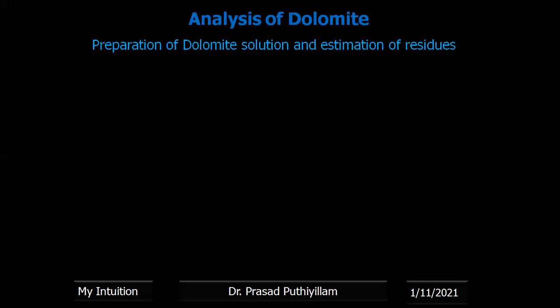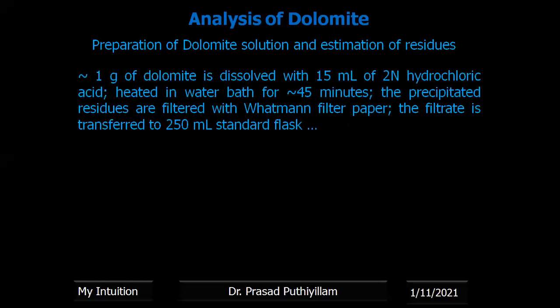Preparation of dolomite solution and estimation of its residues: approximately 1 gram of dolomite is dissolved with 15 ml of 2N hydrochloric acid. It is heated in a water bath for approximately 45 minutes to complete precipitation. If any residues are present, they will precipitate. The hot solution is transferred to Whatman filter paper; the residues and filter paper are separated. The filtrate is transferred to a 250 ml standard flask, made up to the mark, and shaken for uniform concentration.